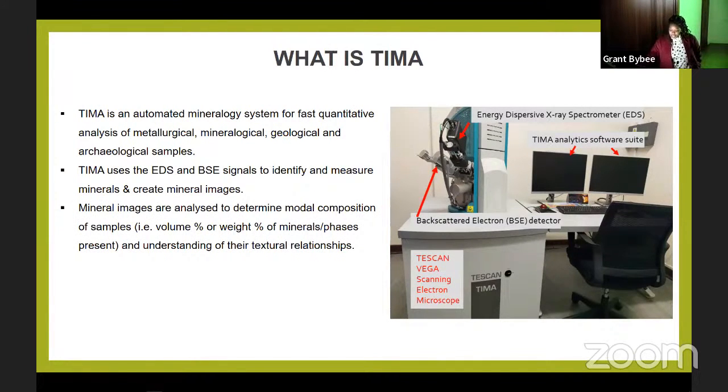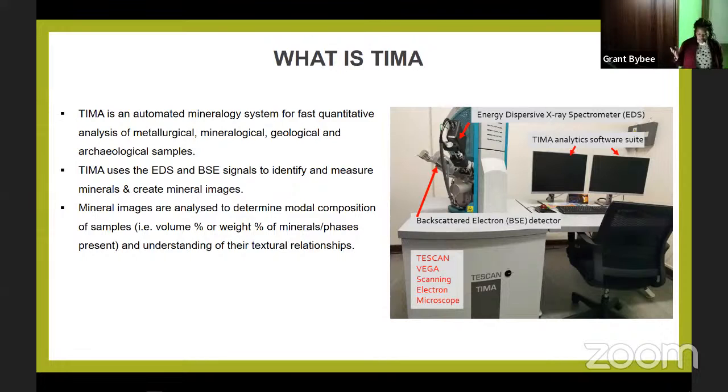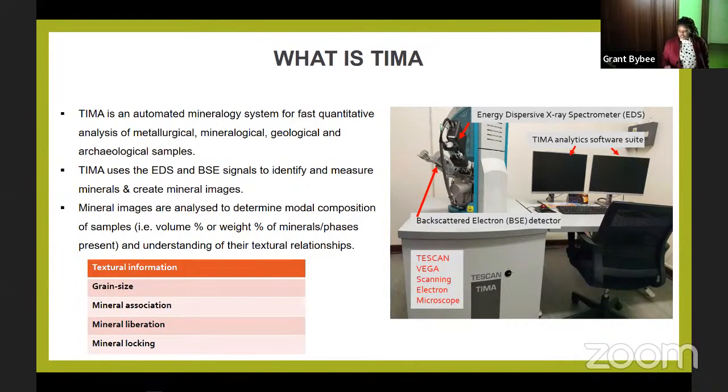As I just said, once the images are created, these images are analyzed using the EDX to quantify the modal composition of the minerals within the samples in terms of the volume, the weight and the mass percentage of the phases present in the sample, as well as studying the mineral association and the relationship in textures. These include the grain sizes, the mineral association, the liberation, as well as mineral locking.